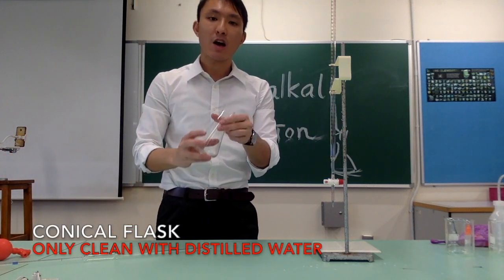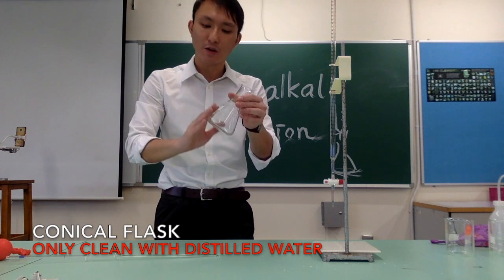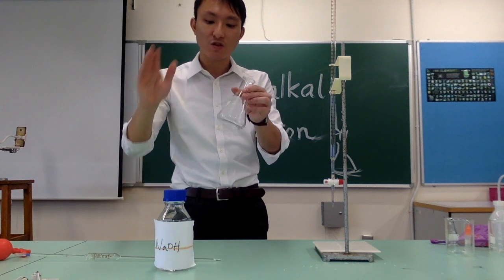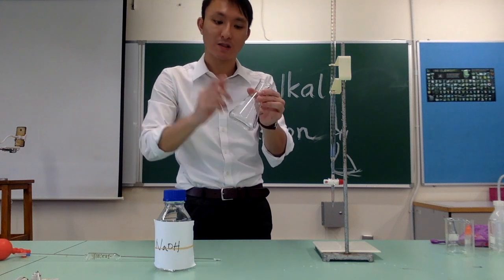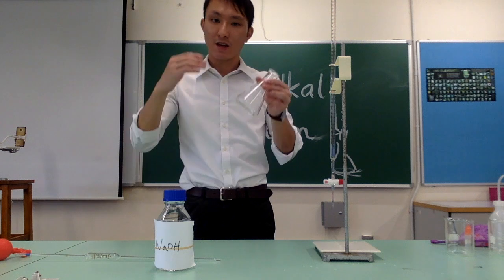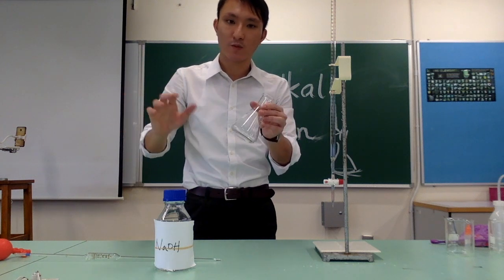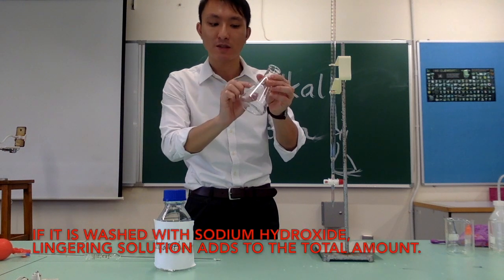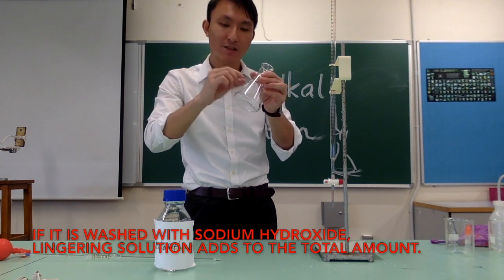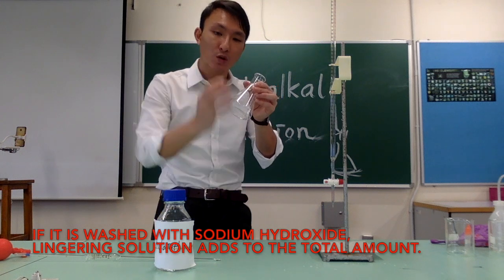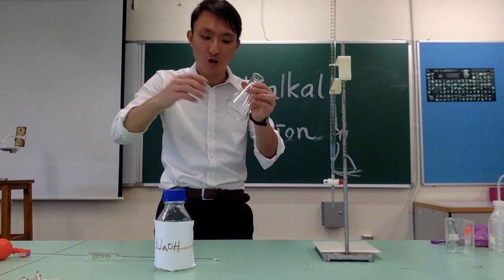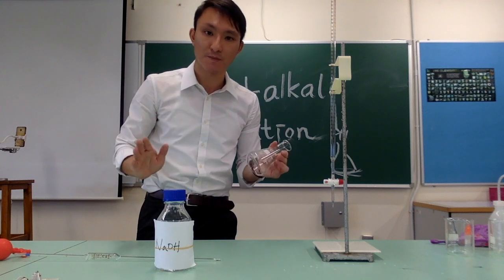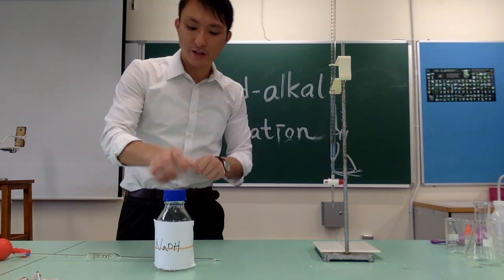This is the general rule, except for one apparatus: the conical flask. We only clean the conical flask with distilled water, even though it is going to contain the sodium hydroxide transferred by the pipette. We do not rinse it with sodium hydroxide because our objective is to transfer exactly 25 cm³ of sodium hydroxide accurately. If you rinse it with sodium hydroxide, there will be some lingering sodium hydroxide that adds to the total amount — so the total is not only 25 cm³ from the pipette. We only rinse the conical flask with distilled water.